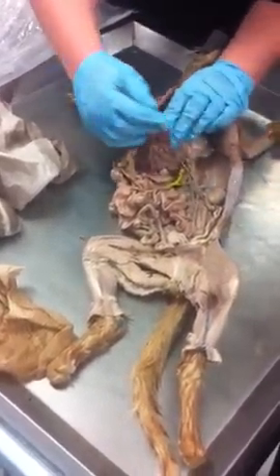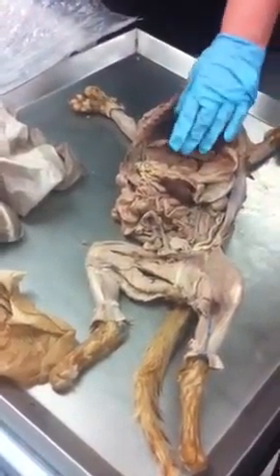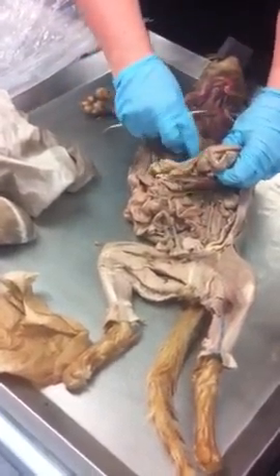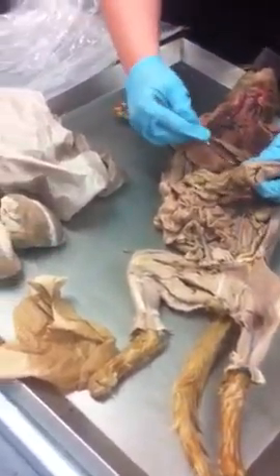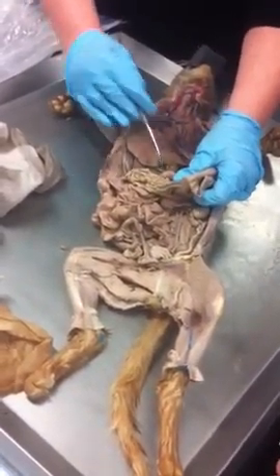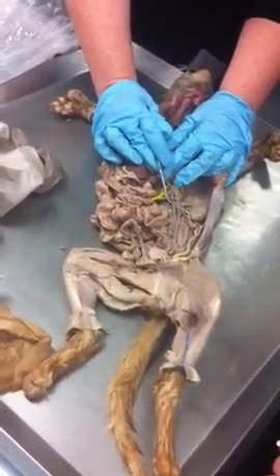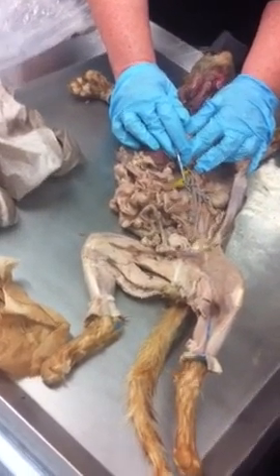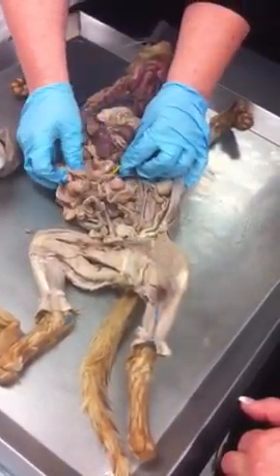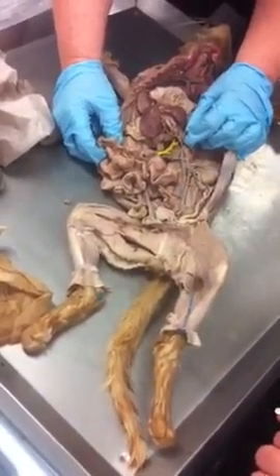And then that last one, the hepatic, diving down right under there. And if I did ask you about the hepatic, it's going to be arranged so you can see where it's going to. So I have something under here, like paper towel or something holding that so you can see where it's going. You just look for that one going up into the liver. What's this one? Superior mesenteric? Yeah, that's superior mesenteric artery. Celiac, superior mesenteric, way down here, inferior mesenteric.